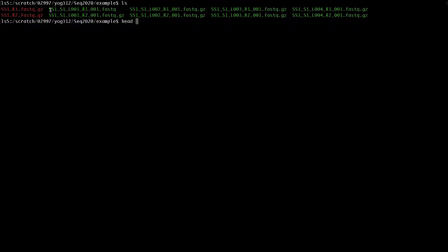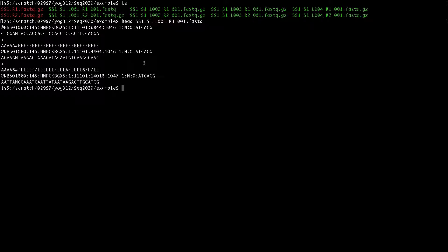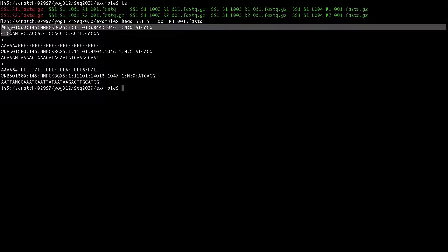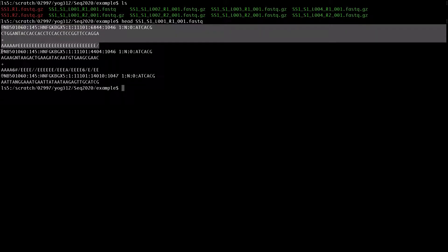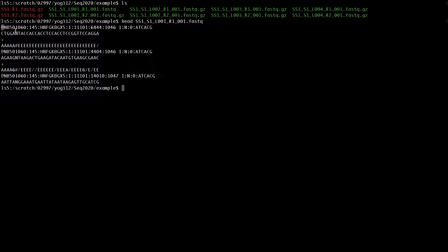If we do 'head' to just look at the top ten lines of our FASTQ file, you can see that there are one, two, three, and four lines for each read. So that is one read, and then you have another read here. Information for each read in a FASTQ file starts with the '@' sign — this is just a sequencer identifier. Then you have your actual DNA sequence — in this case 35 bases — and then a plus sign which separates your DNA sequence from the quality score.